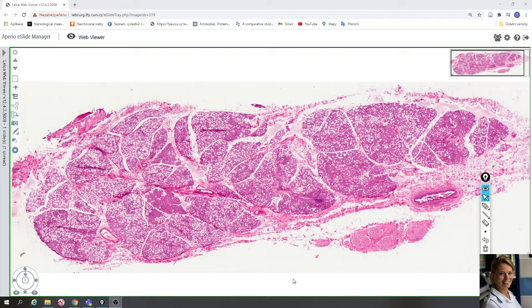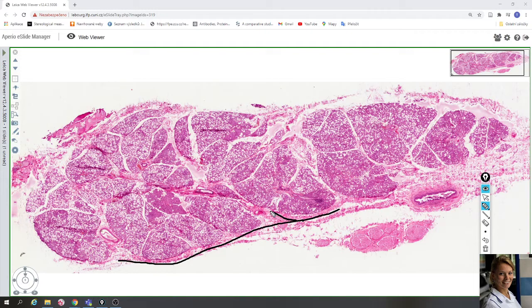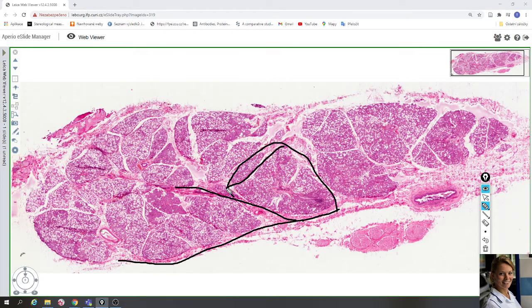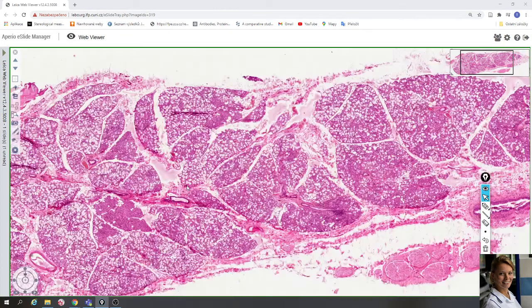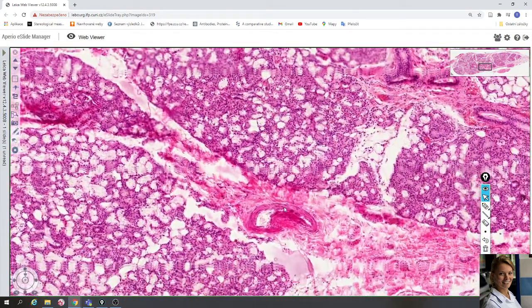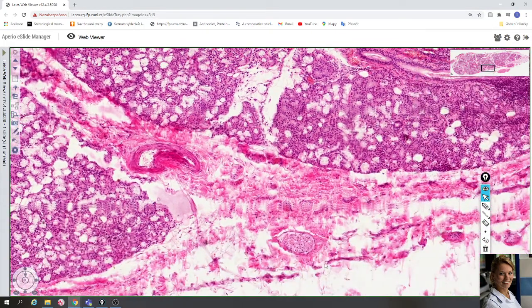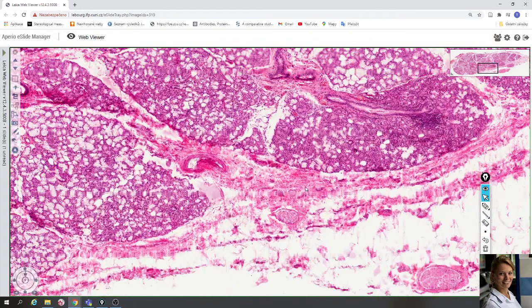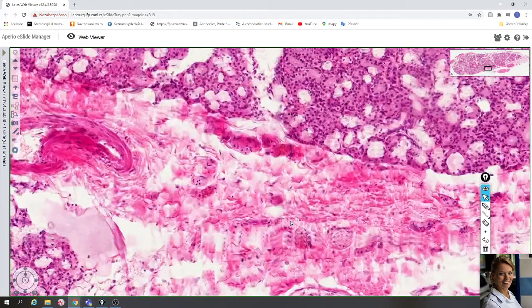The sublingual gland is covered by a fibrous capsule, as you can see here. Fibrous trabeculae arise from this capsule and subdivide the gland into lobes and small lobules. In the fibrous trabeculae you can find interlobar ducts, blood vessels, nerve fibers, nuclei of fibroblasts, and collagen fibers.